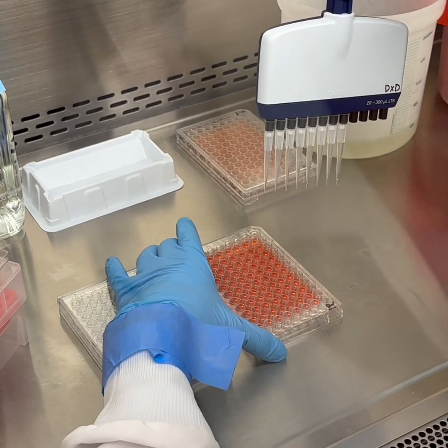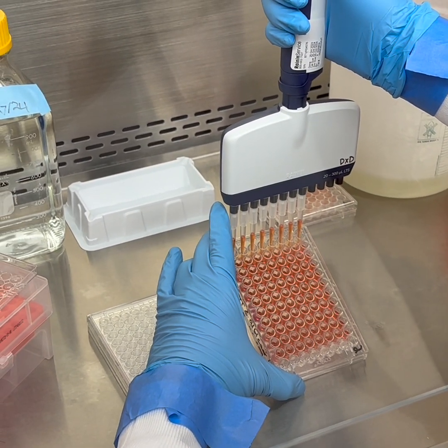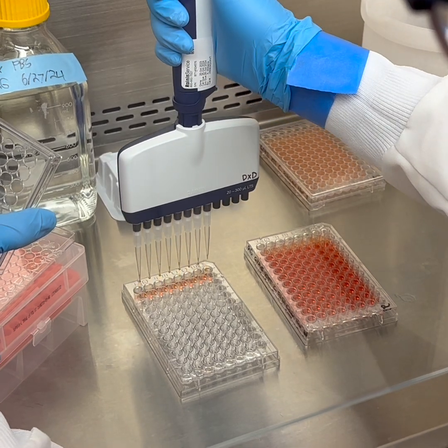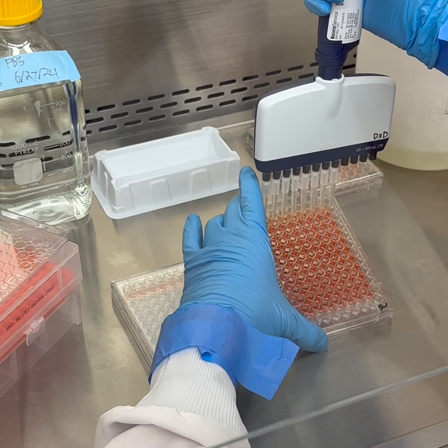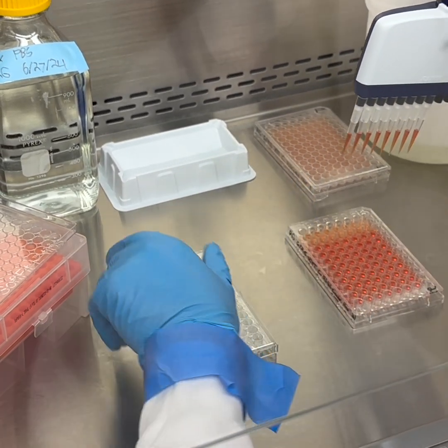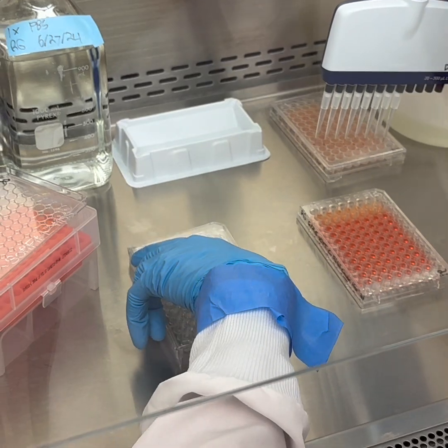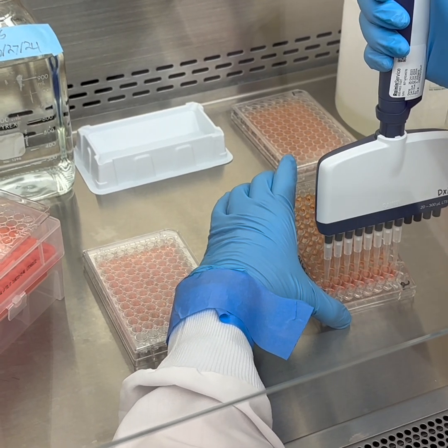Okay. Now I'm going to start from column 1. About 75 microliters. And this is our positive control.